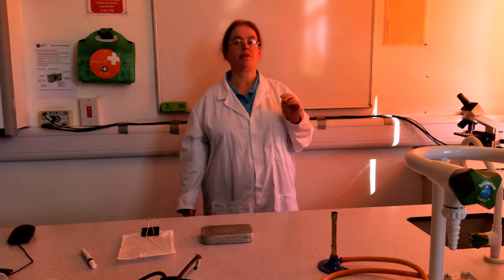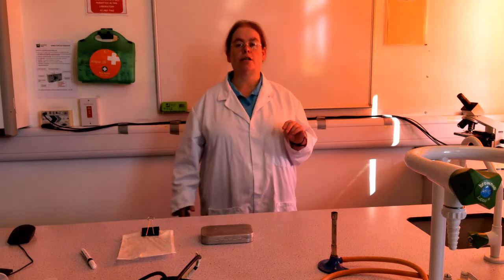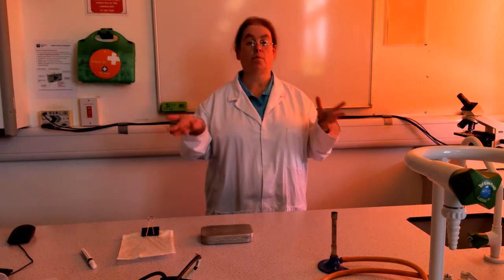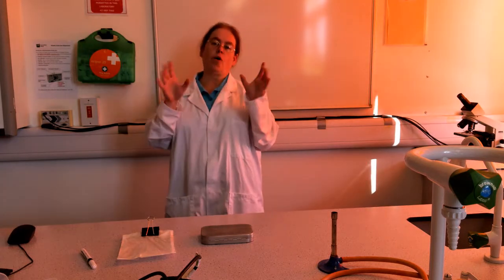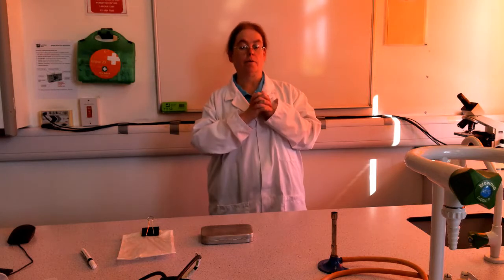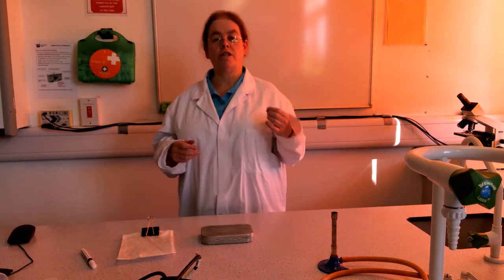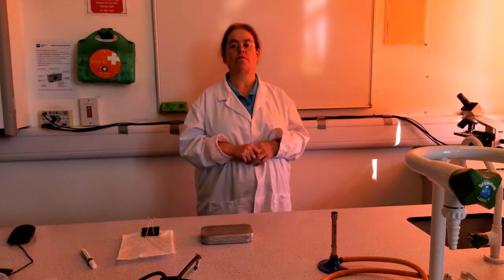Now, actually, one of the commonest ways in labs today when we're testing things is to use a machine called a spectrophotometer, which quite simply just shines light through and looks at what percentage has been absorbed. Since bacterial cultures are all murky, obviously the more bacteria there are, the less the light gets through. And in fact, when you go into commercial labs testing antibiotics, disinfectants, best growth media, that's what they do. Now, we do have some spectrophotometers, but they're not really for microbiological use, obviously.